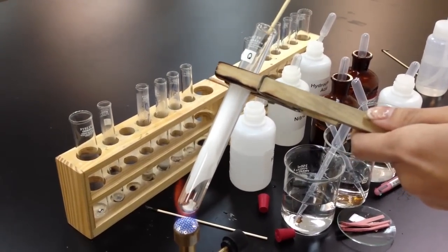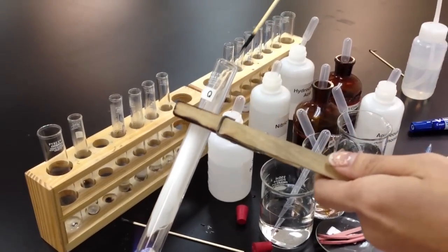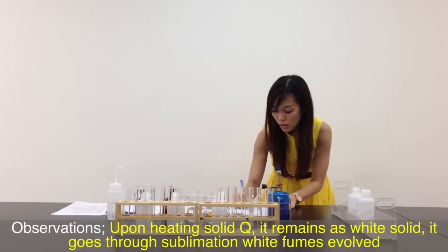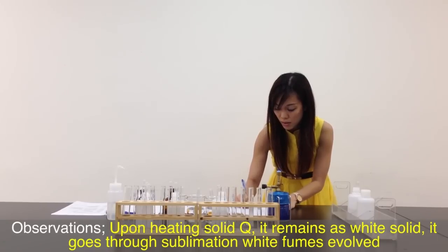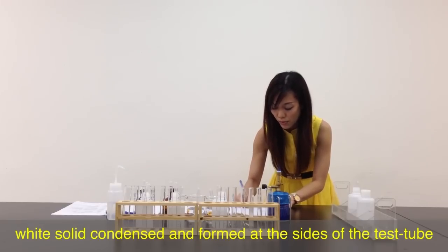The white fumes evolved actually extinguish the glowing splint. Solid Q did not change any colour — it remains as white. Let me write down the observation: upon heating solid Q, it remains as white solid. It goes through sublimation. White fumes evolve, and white solid condenses and forms at the side of the test tube.